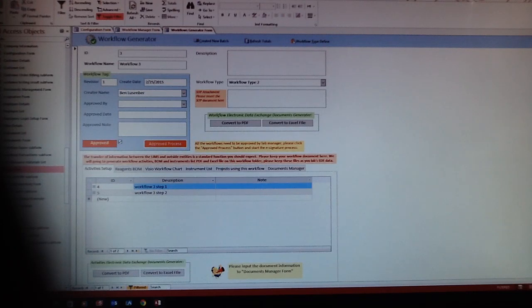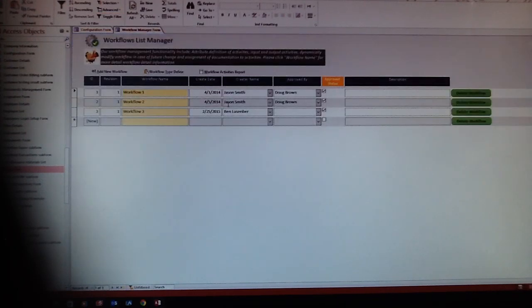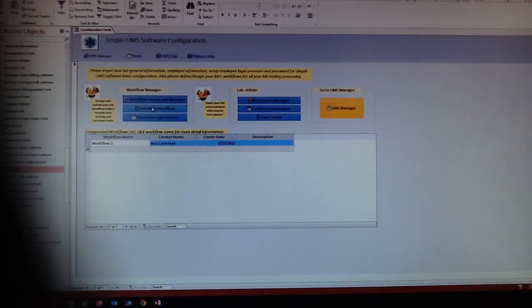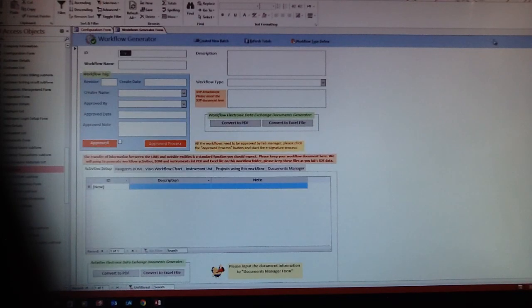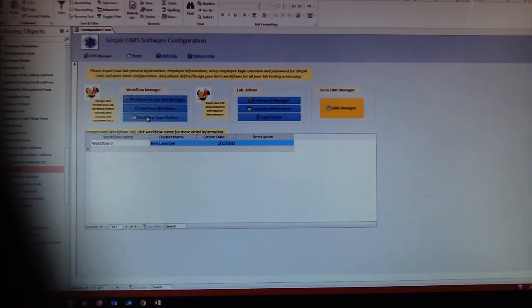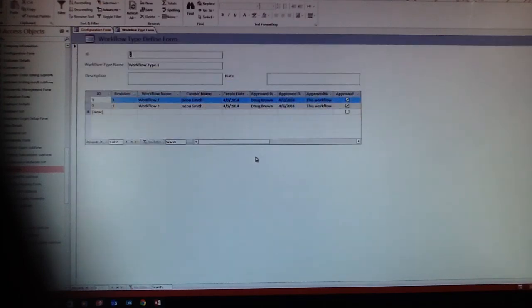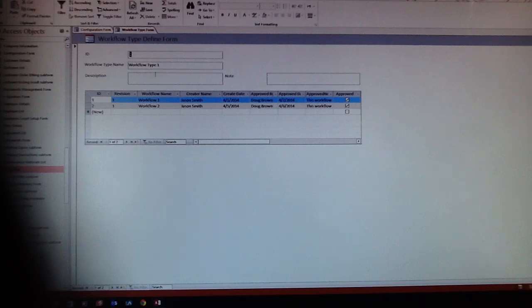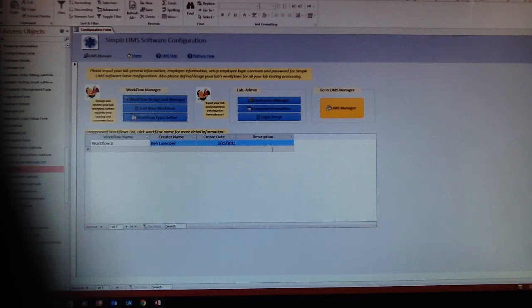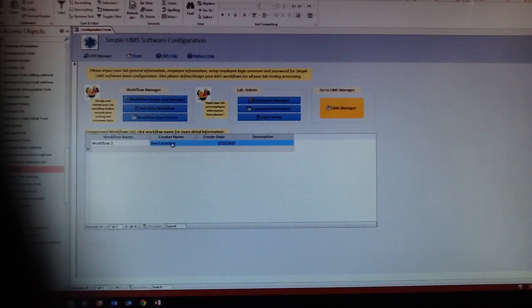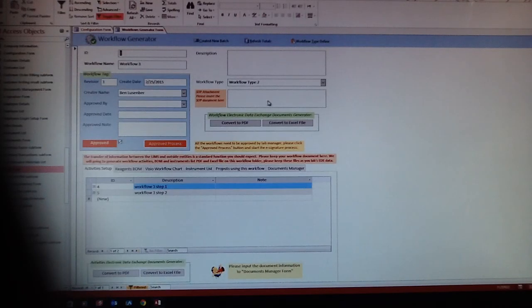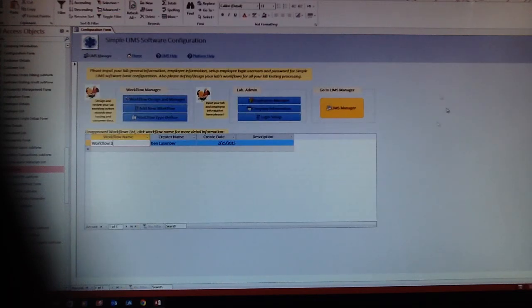After these things are done, you can start your test. If you want to add a new workflow, you can add one here. Here is the type definition. You can define different kinds of workflow types to match your lab's needs. After that, here is the list for workflows you have defined but have not approved yet. You can click the workflow names and wait for someone to approve that.